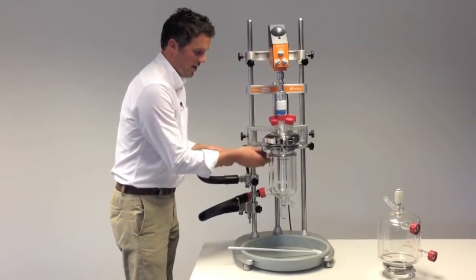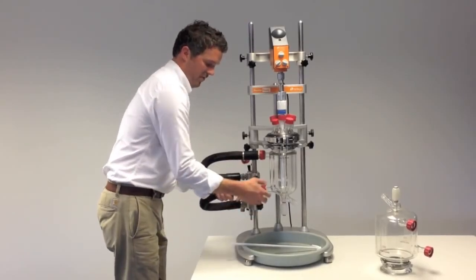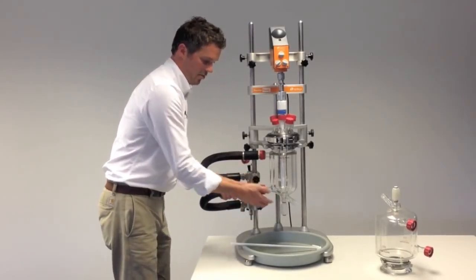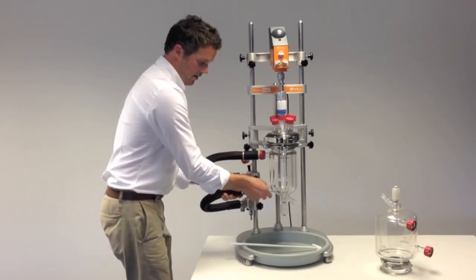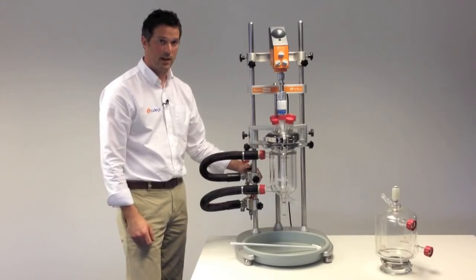Then reattach the hoses. These just push fit and the red collars tighten them onto the sidearms. Once you close the vent valve on the top, you're ready to fill up from your recirculator again.